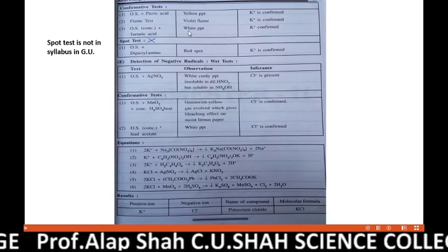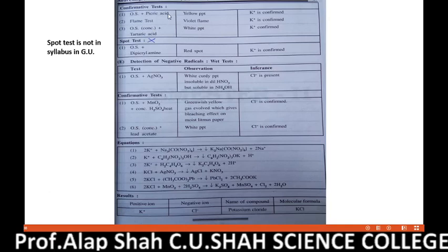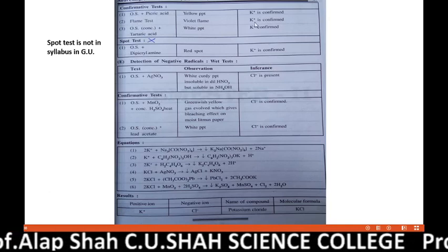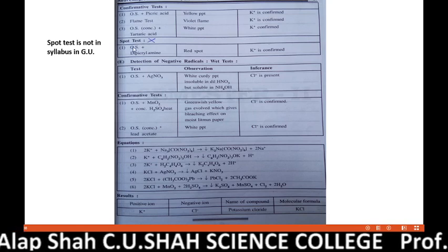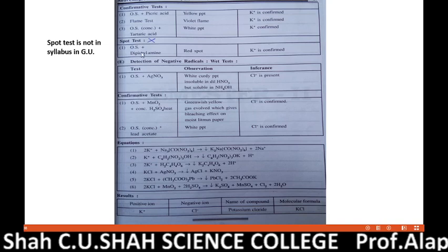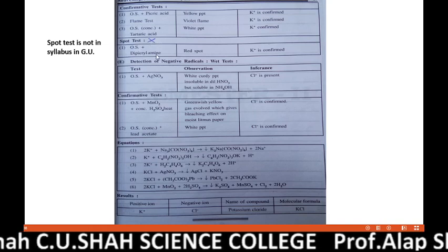Once the positive ion is detected, we do confirmative tests. These are the confirmative tests given. So K plus is confirmed present. Spot test is no longer part of the curriculum. Earlier it was, so that's why I have cancelled it.